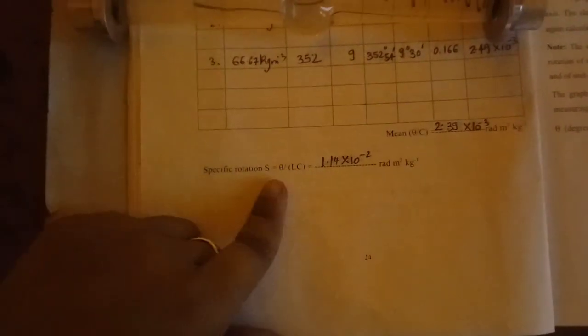Finally, you have the specific rotation, which is the measure of theta by LC. So L is basically the length of the tube that we'll be using. So this is the tube, right? You have to measure the length from this end to this end, which is the region where the optically active sugar solution is placed. So once you find that length, you can find specific rotation as equals theta by LC. So it will be in radians meter square per kg.